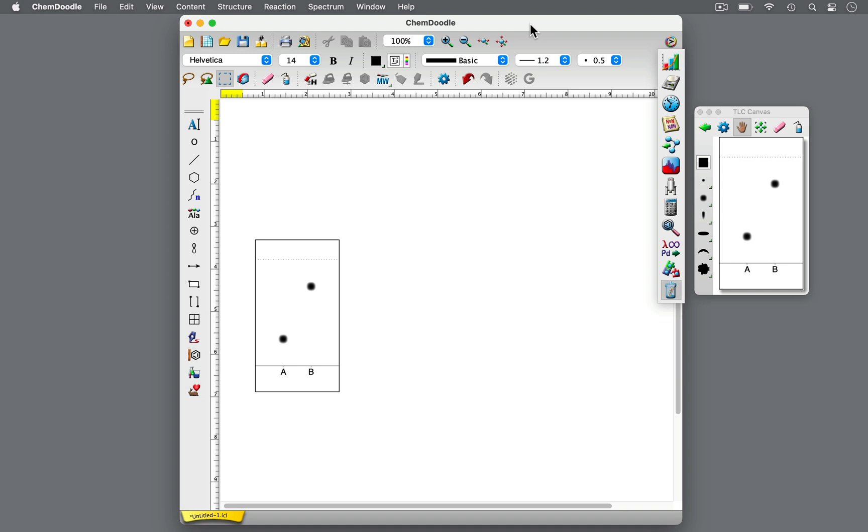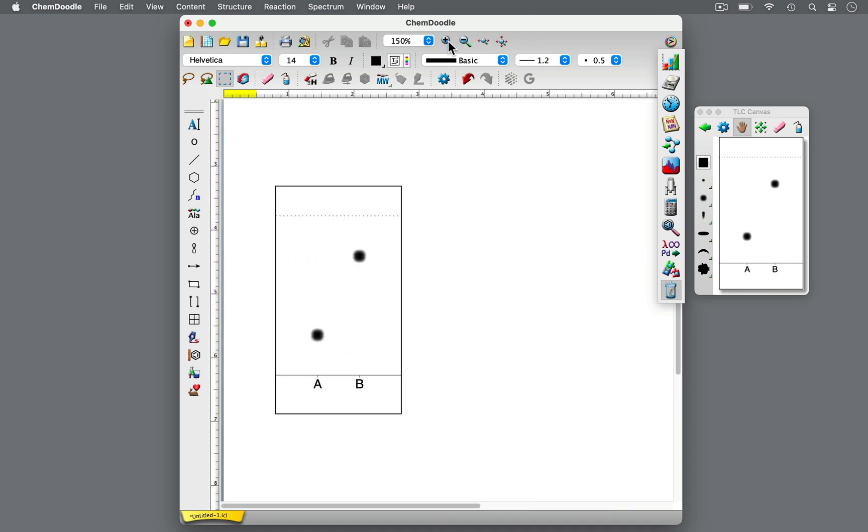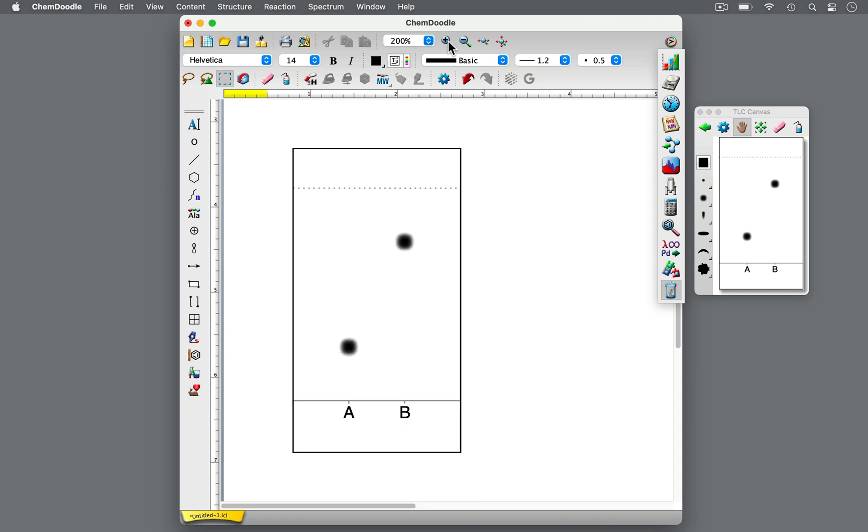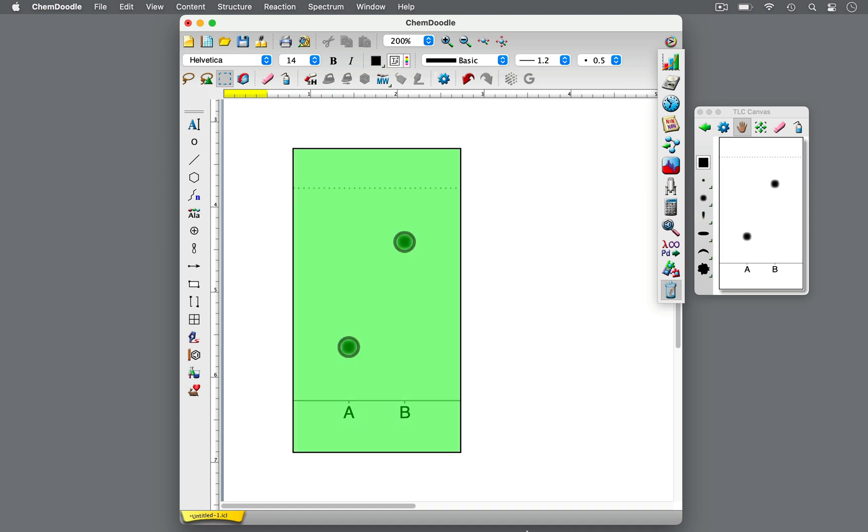Once the solvent has evaporated from the TLC plate, the spots can be visualized. Not all spots are colored, so a common technique for visualizing spots is with shortwave UV light at 254 nm. Under a UV lamp, the TLC plate fluoresces, while the samples are seen as dark spots. Circle and outline the spots with a pencil. Now the TLC plate can be analyzed.